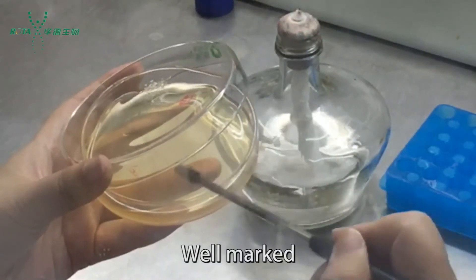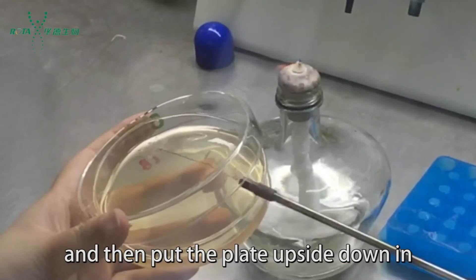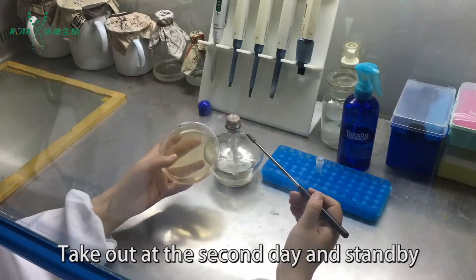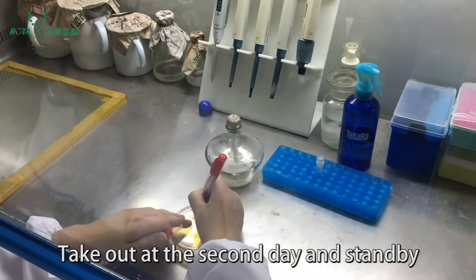Mark the plates well, then place them upside down in the constant temperature incubator at 37 degrees Celsius overnight. Remove the plates the next day and set aside.